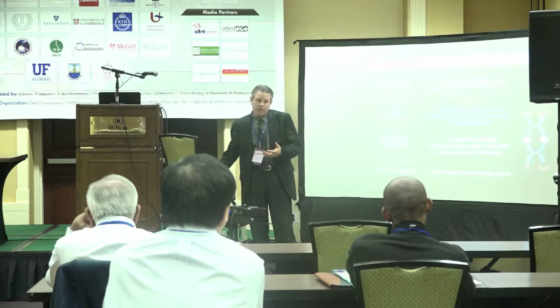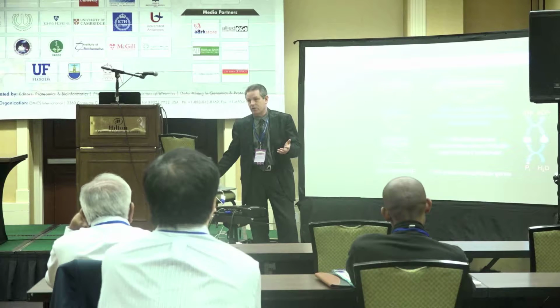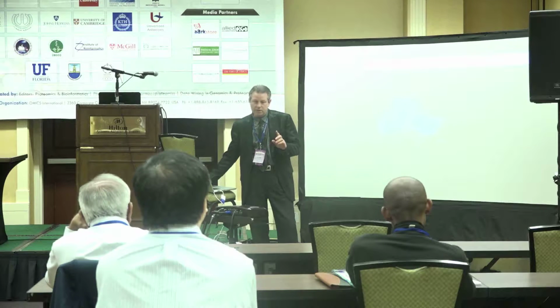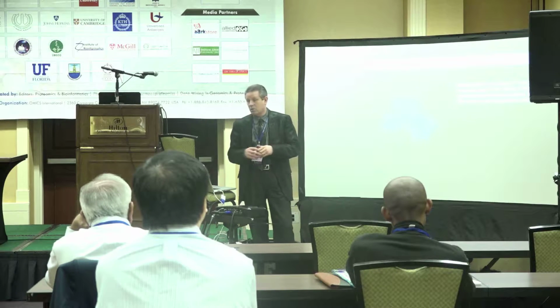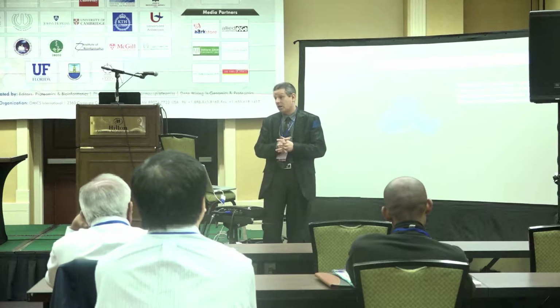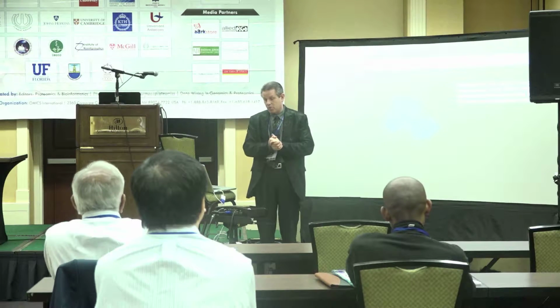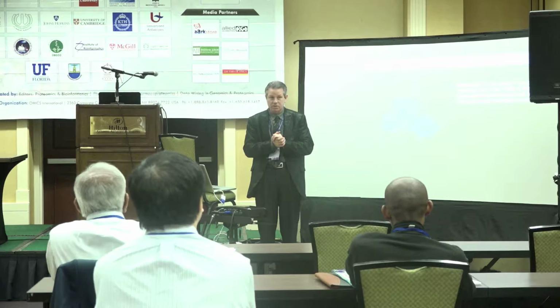So, is there a way that we can use antibody microarrays as a way of tracking large numbers of proteins of interest that are low abundance in a directed fashion? And this is what we can do. This is really contingent on the availability of really good antibodies. And so over the last 17 years at Kinexus, and before that, my first company, Kinetek Pharmaceuticals, we developed a lot of the early antibodies for Upstate, UBI and StressGen.